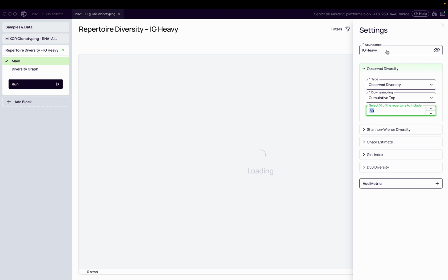Measured, as I mentioned, in this case, in terms of the UMIs. Or the option, which is the default, is random sampling. And this is a very powerful and the most standard way how you do this normalization. You just pick randomly that amount of sequencing data, in this case molecules, that will match the resulting abundance across all of the samples.